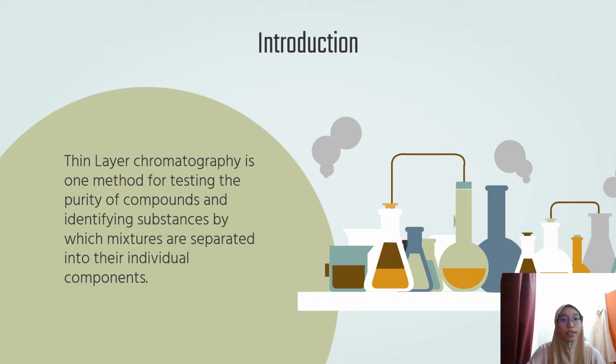In TLC, substances are distributed between a stationary phase and a mobile phase. The mobile phase is generally a mixture of non-polar organic solvent, while the stationary phase is polar inorganic solvent, which is trapped between the cellulose fibers of the TLC plate. One phase is the solvent held in the pores of the plate used, and the other is the mobile phase, which moves over the plate. Components of the sample will separate readily according to how strongly they adsorb onto the stationary phase versus how readily they dissolve in the mobile phase.